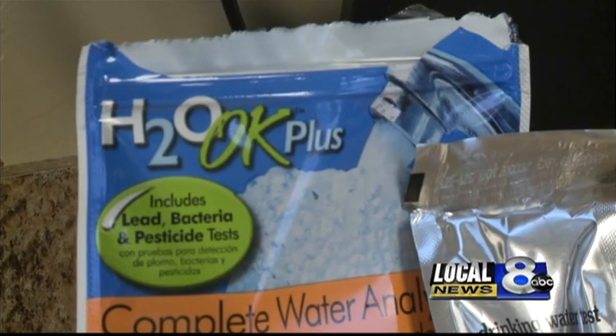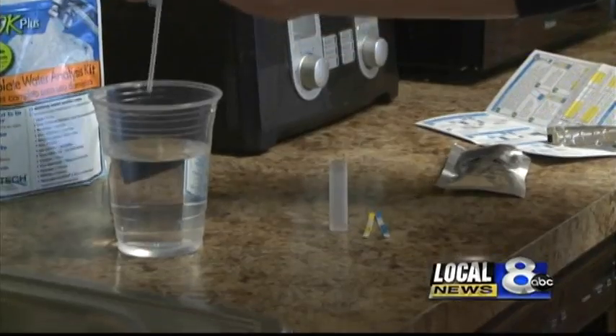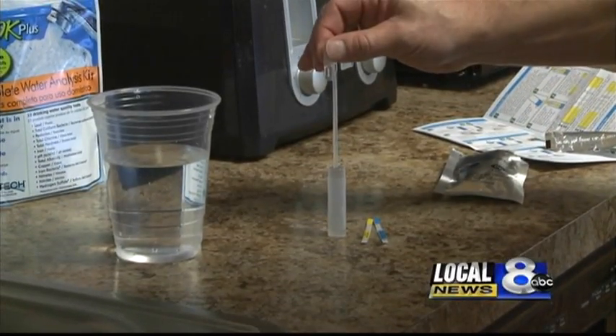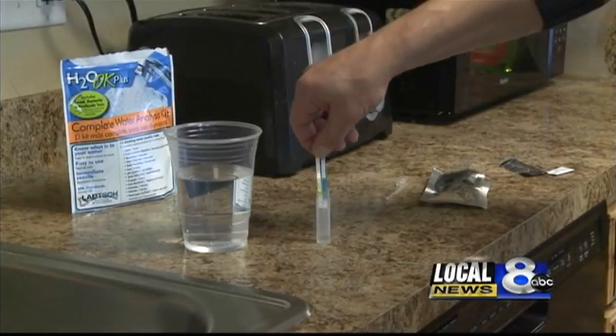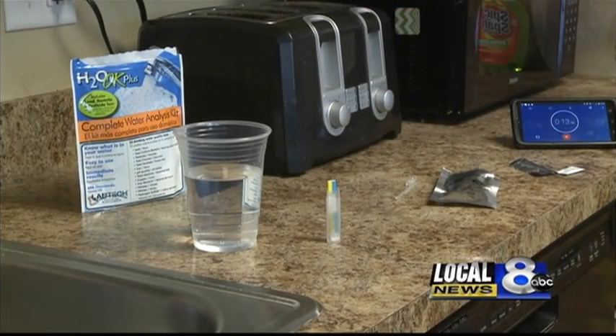We decided to buy one of those test kits ourselves at the station and tried it out in the employee's lounge. We specifically tested our water for lead, followed the directions, and dipped the test strips in the water and waited 10 minutes for the results. Two lines showed up, indicating we do not have any lead in the water at Local News 8.